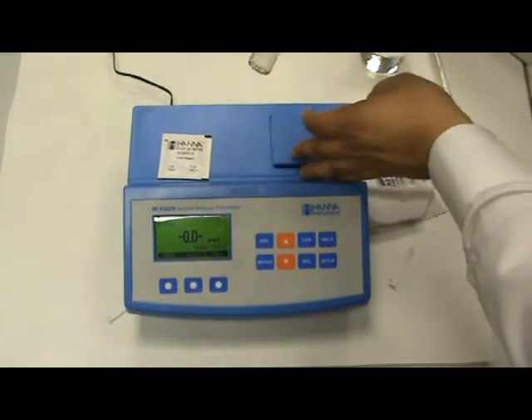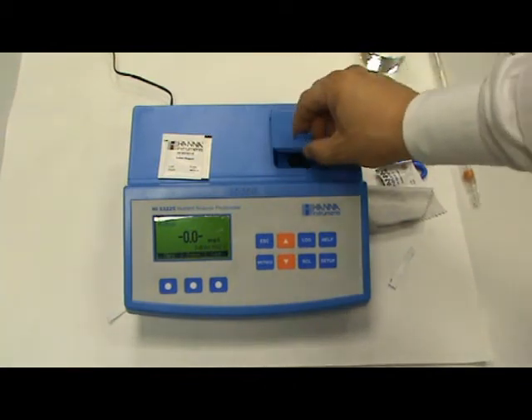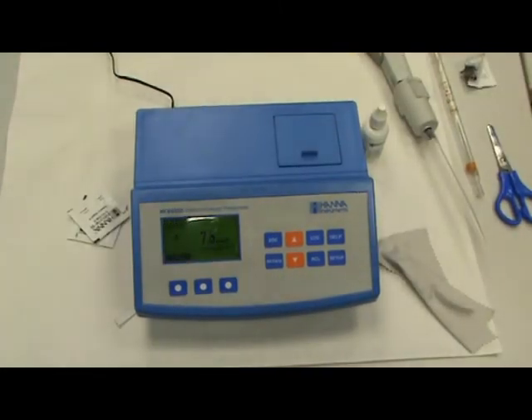Y volvemos a introducir la cubeta con el 10 frente al puntito azul y pulsamos al cronómetro. Ahora el equipo hace una cuenta atrás de 5 minutos y cuando acabe la cuenta atrás medirá los sulfatos. Está leyendo. Y el resultado: 7,5 miligramos por litro.